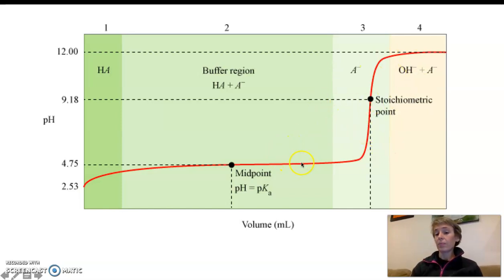Now eventually, once I neutralize all of or most of those acetic acid molecules, when I run out of them, then we see something very similar to what we saw in the first titration in this lab. A very steep pH increase over just a small volume. Yeah, when we run out of that buffering capacity, pH jumps up really, really quickly. So I think this will be helpful for you guys in understanding what's happening in the next procedure video.